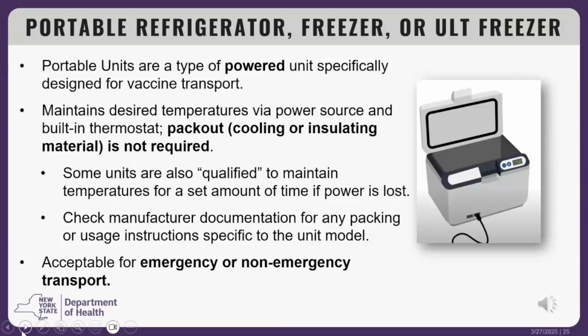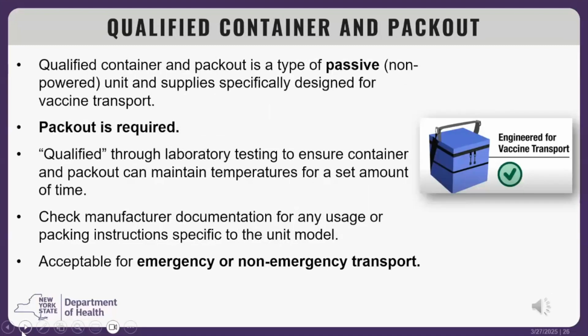Another option for emergency vaccine transport is qualified containers and pack-outs. These units are non-powered and specifically designed for vaccine transport. They require insulating materials and can maintain temperatures for a set amount of time. Check manufacturer documentation for any usage or packing instructions specific to the unit model.